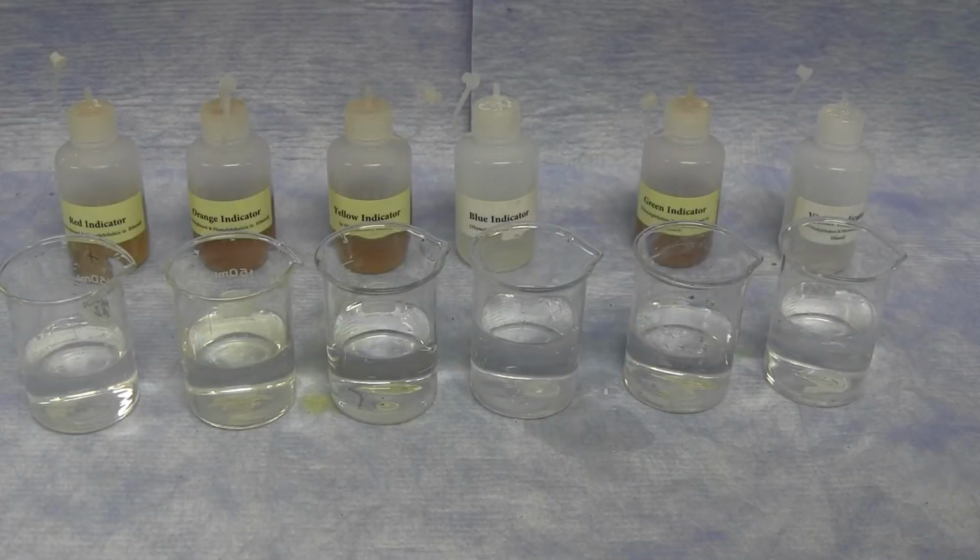Indicators are chemicals that have a color property associated with their chemical structure. Under certain conditions, the structure of the chemical itself is such that there is no color. All of these solutions are slightly acidic at the moment.